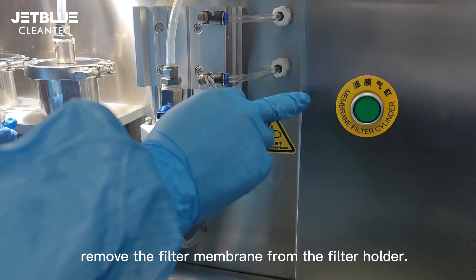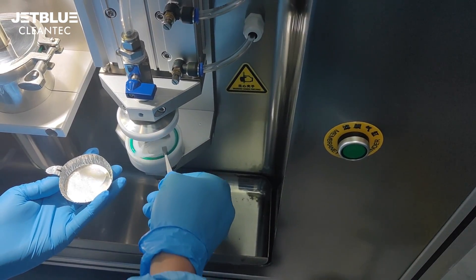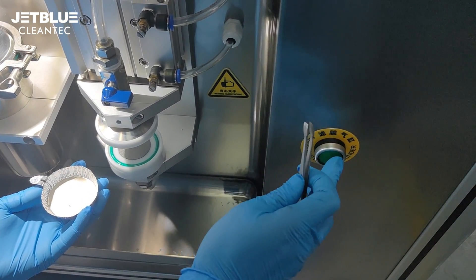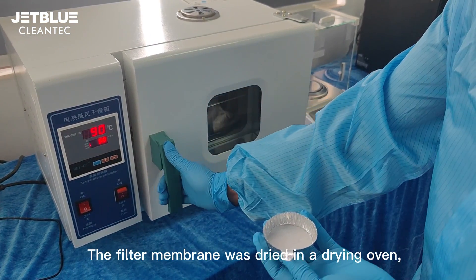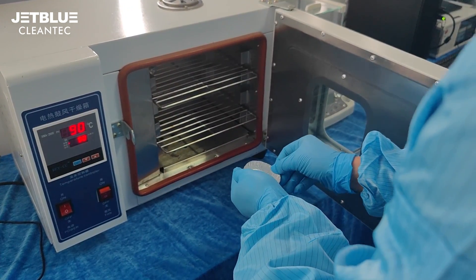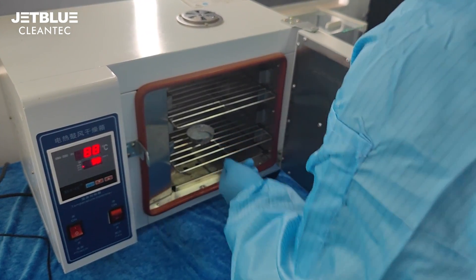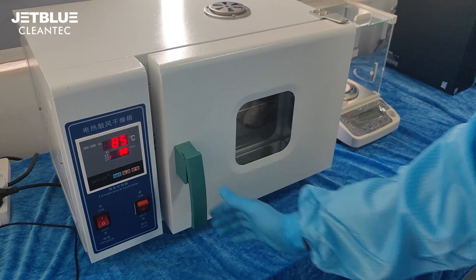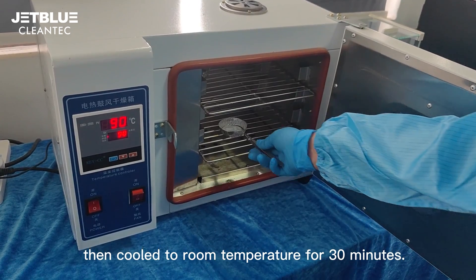After cleaning, remove the filter membrane from the filter holder. The filter membrane is then dried in a drying oven and cooled to room temperature for 30 minutes.